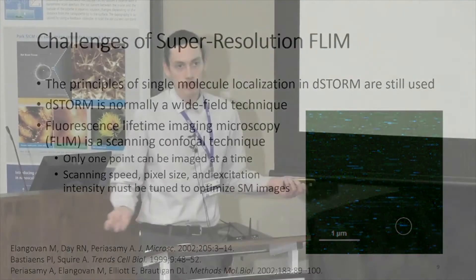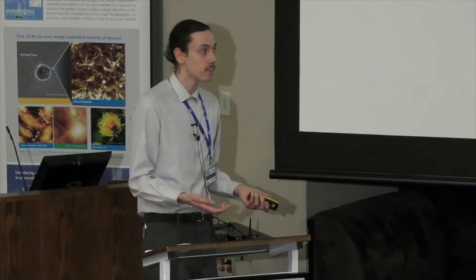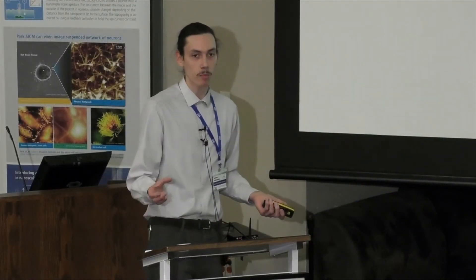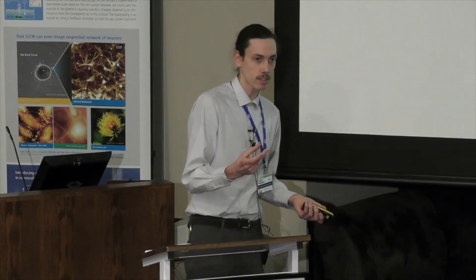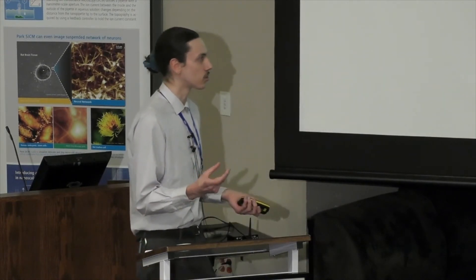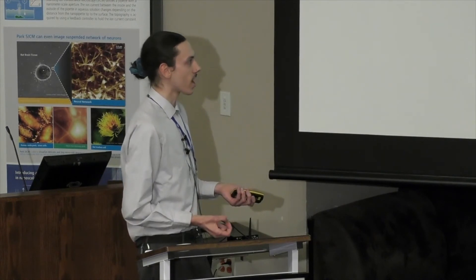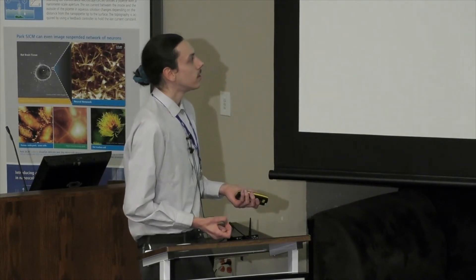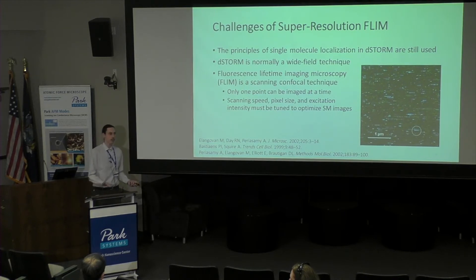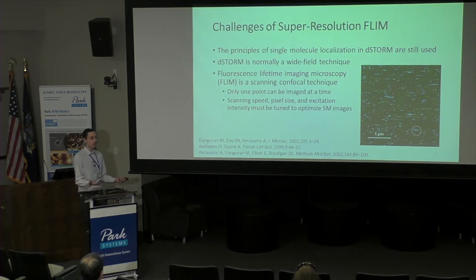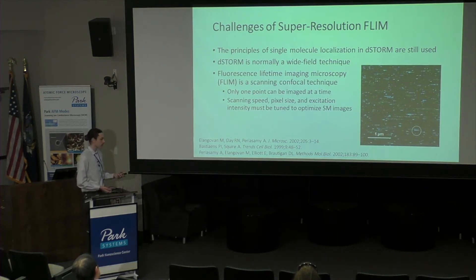The problem we run into with high scanning speeds, small pixel sizes, or high excitation intensity is that your molecule will turn off while you're imaging part of it, and you will get an incomplete point spread function. An incomplete point spread function cannot be fit, and you can't get proper localizations — it's really important to know precisely with certainty where the emission happened. In order to make this work, we need to optimize scanning speed, pixel size, and everything else so that we are getting nice single molecule images with the confocal scanning setup.